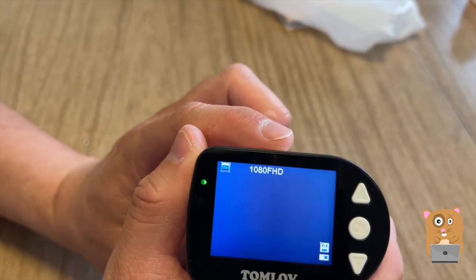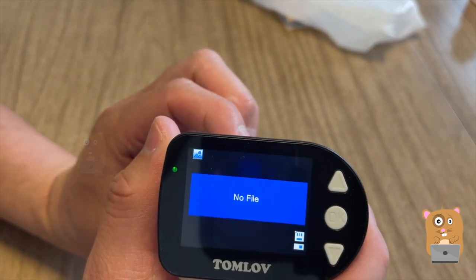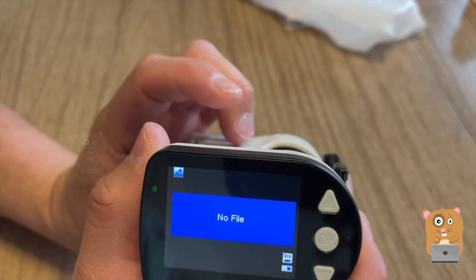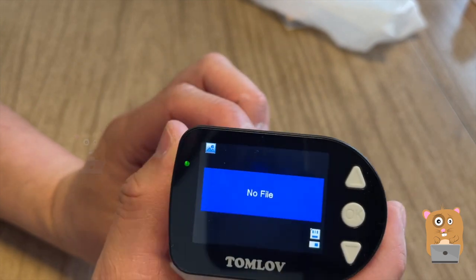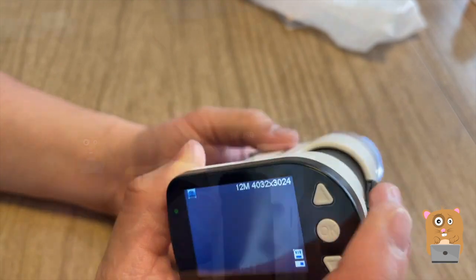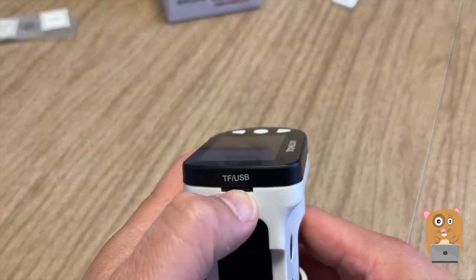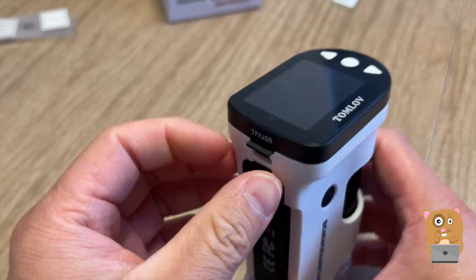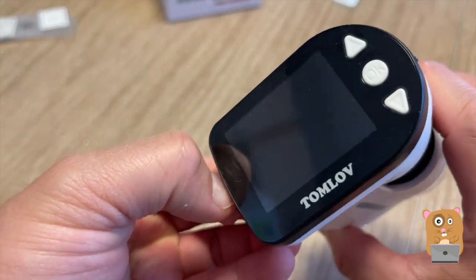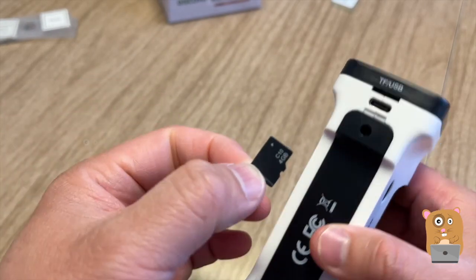Before it was image mode, now it's 1080p Full HD. I think the second press is to review what was recorded. Now it's back to image mode. Right next to the 2-inch LCD display, just press on this little slot and it will eject the micro SD card. The one that came with it is a 4GB micro SD card.